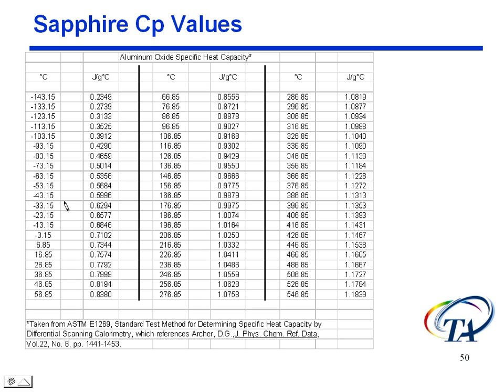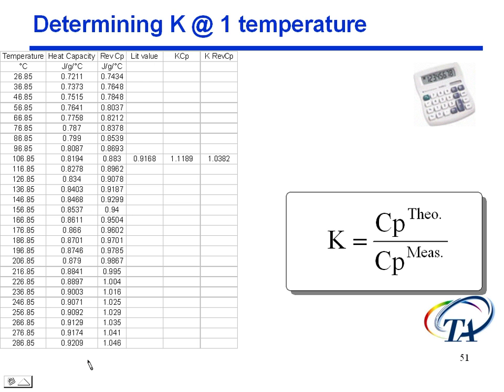And you can see down here at low temperatures it's minus 143.15, and so on. But once we get above zero, it's 6.85 degrees, and every 10 degrees after that. So that's why I did that when I look at my data table. And then here's also, just for your information, the reference of where we get this information from. It's ASTM 1269.